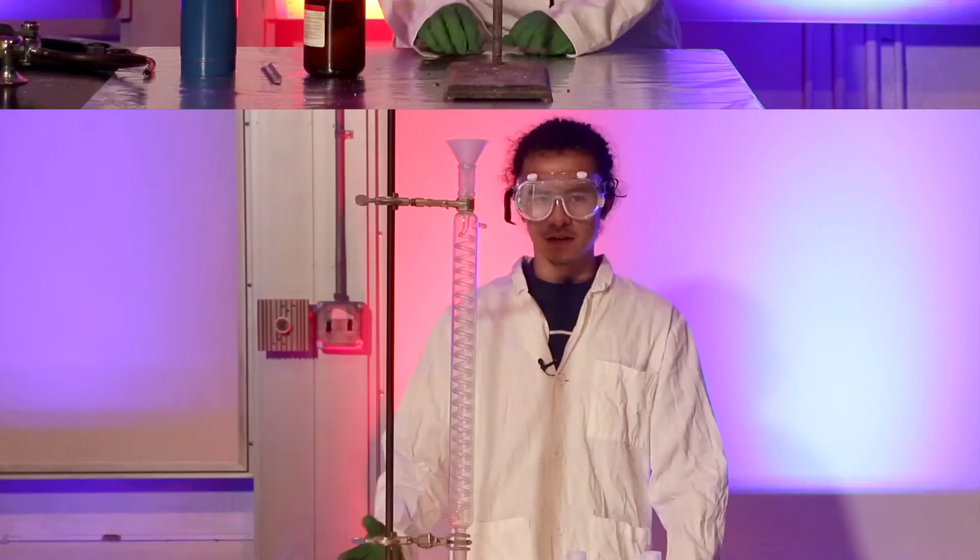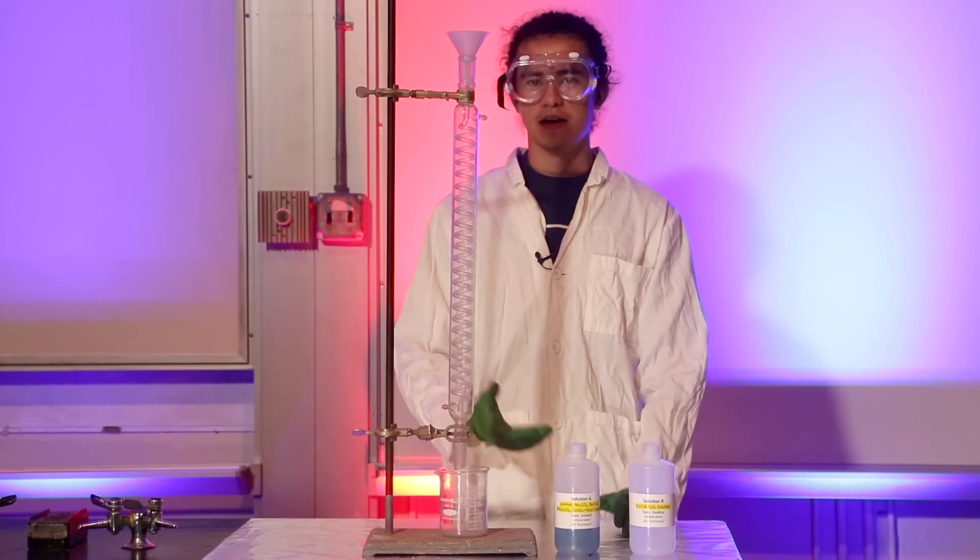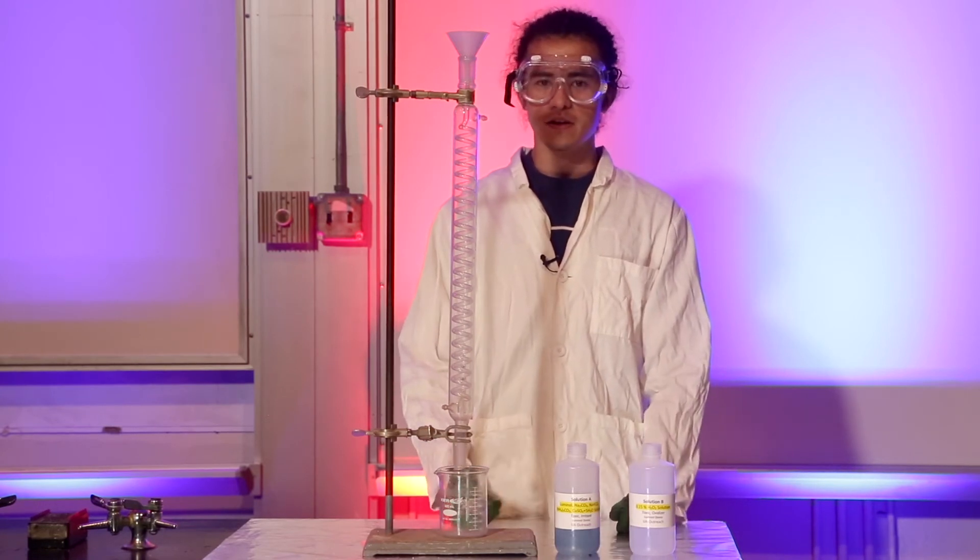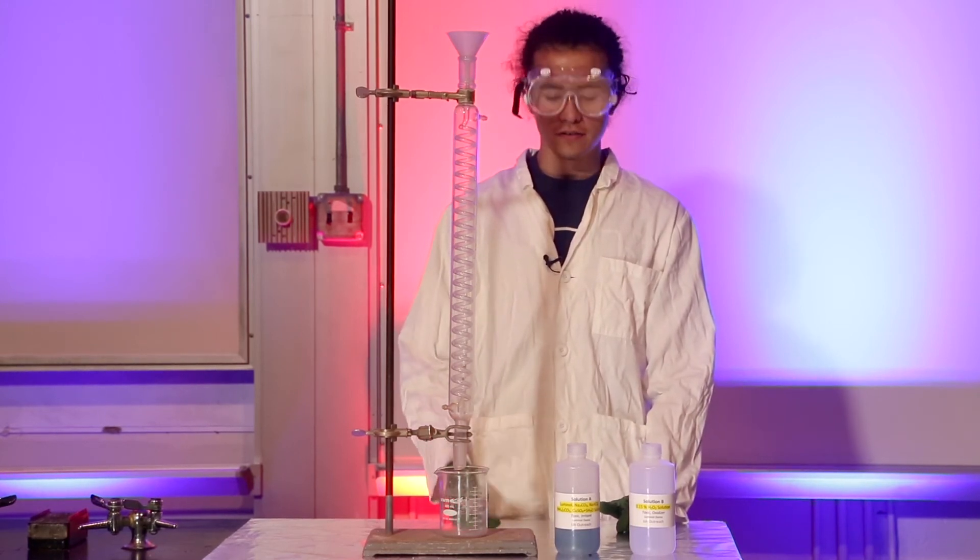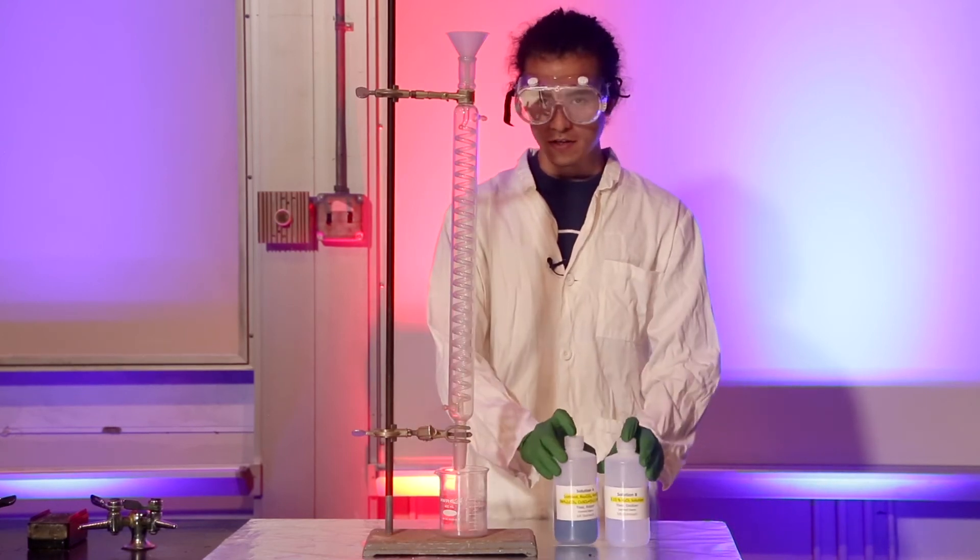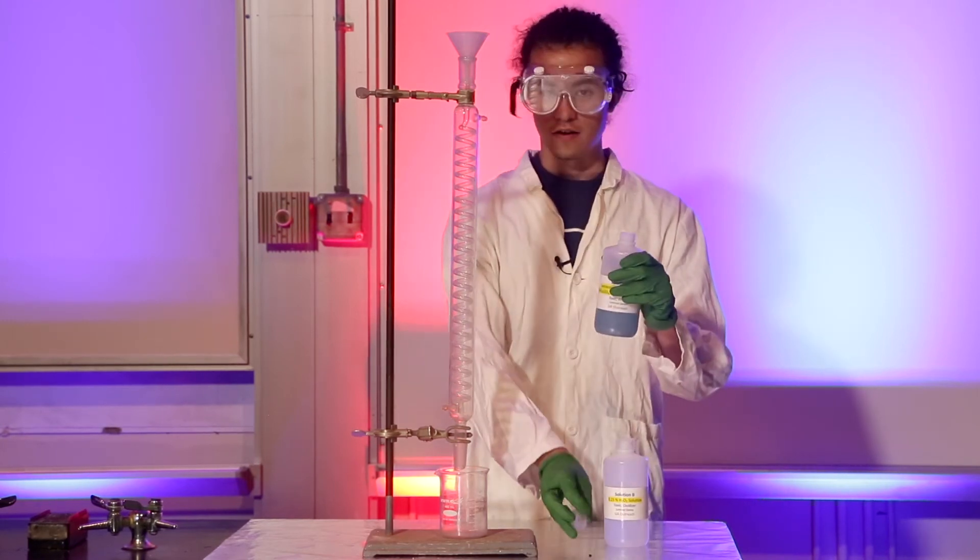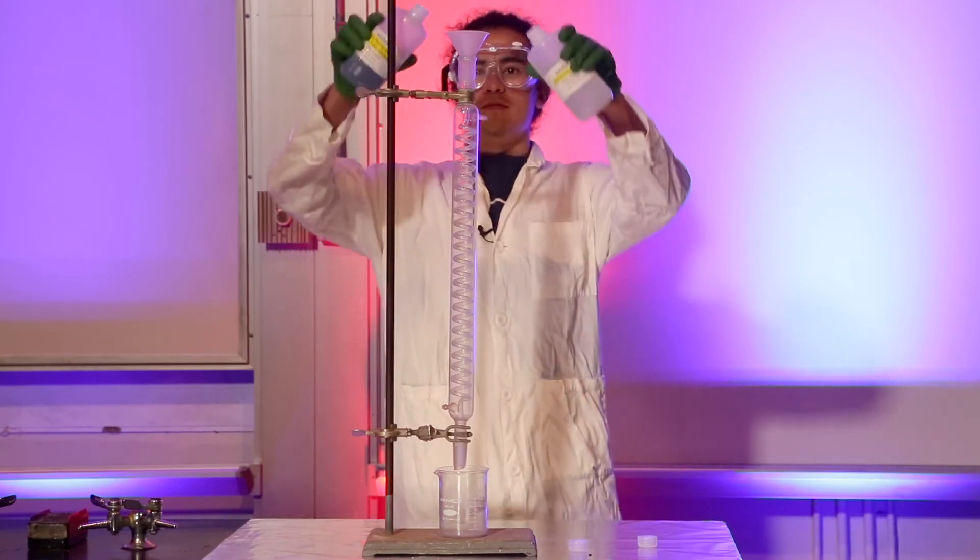Hello, we're going to be taking a look at chemiluminescence—chemi just for chemical and luminescence for light. Different reactions have different ways of expressing themselves. Some reactions give off heat, some require heat to happen, some give off light, some give off radiation. Here we're going to take a look at chemiluminescence, a reaction that produces light. By themselves they're kind of boring—they don't do anything. But when combined together, as these two substances come in contact with one another, first in the funnel and then throughout the column, they just react and give off a little bit of light.